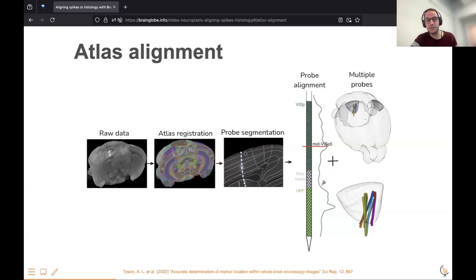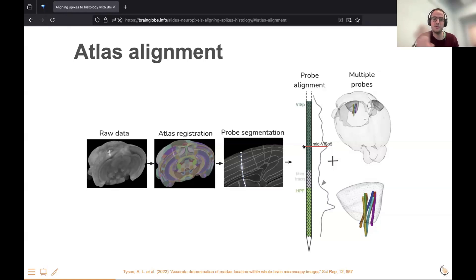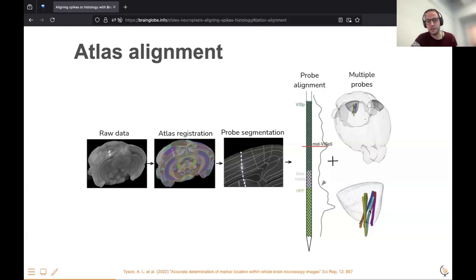Then you can segment your probe either automatically or manually. In this case it's quite easy because it's a one-dimensional thing — you can stick some points on it and fit a line through those. That allows you to visualize and analyze the probes, both in your sample space and also in the atlas space, where you can overlay several probes from different animals to check that they're all in the region you expect. Here, seven animals are all more or less placed in the same location in the visual cortex.